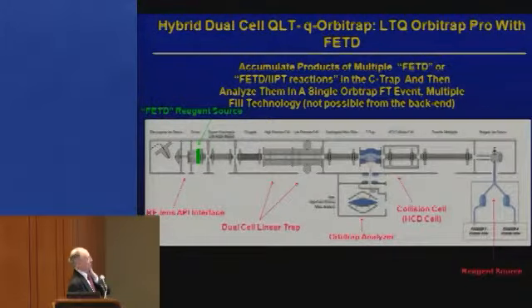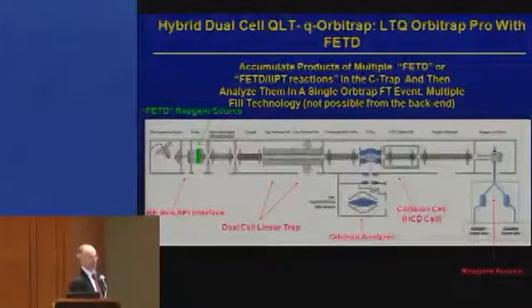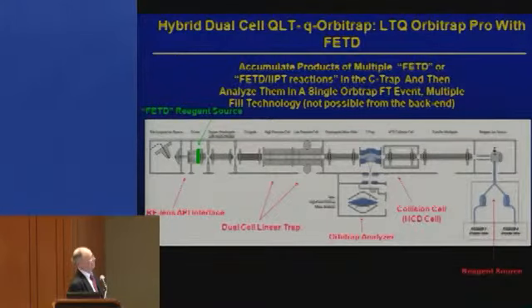Now, many people doing top-down work at the moment in the field actually average transients, or they average the results they get from a particular spectrum. And to get the right sensitivity, they're sometimes averaging 100, 200, 300 scans, or in a recent paper, even 20 HPLC runs, just to get enough ion current to do the mass analysis of an intact protein. But when you average transients or you average spectra, the signal-to-noise you get goes as the square root of the number of scans that you took. So you have to take 100 scans to improve the signal-to-noise by a factor of 10.